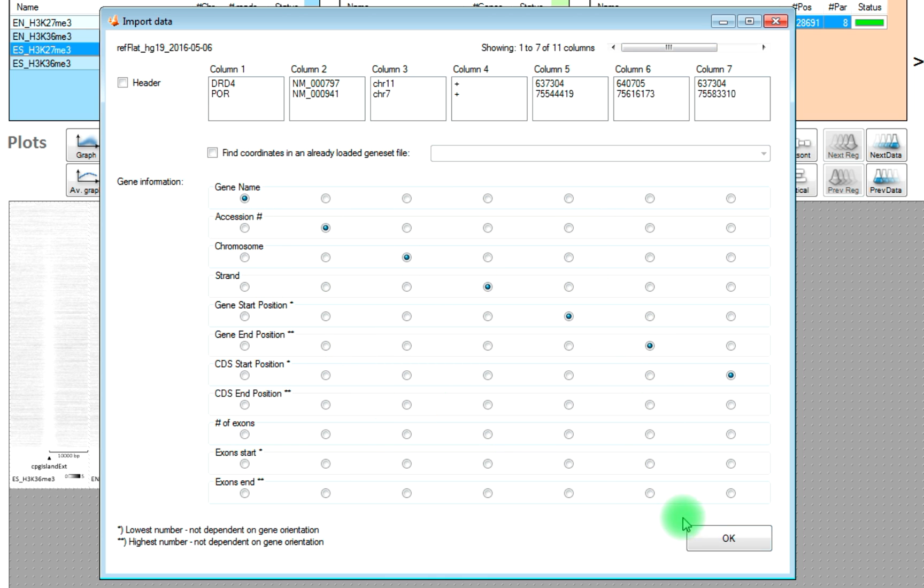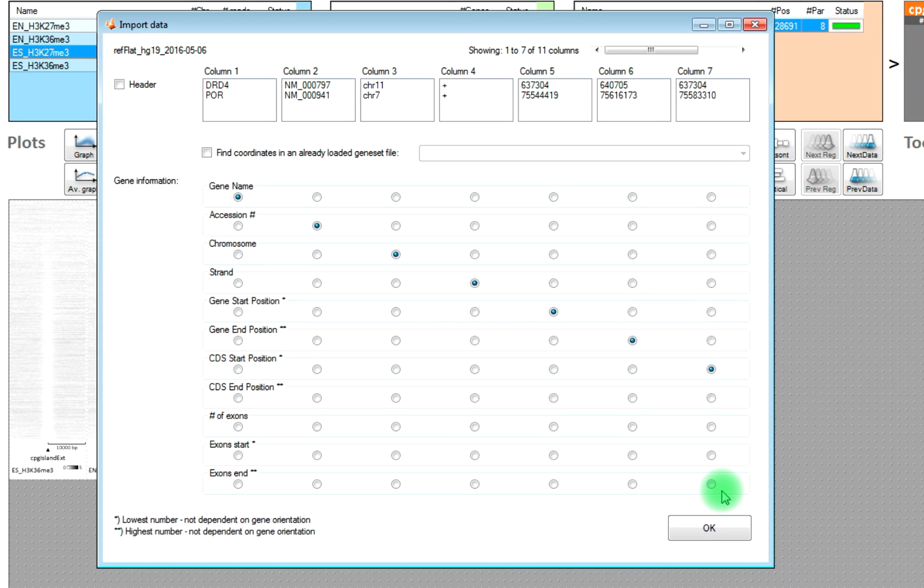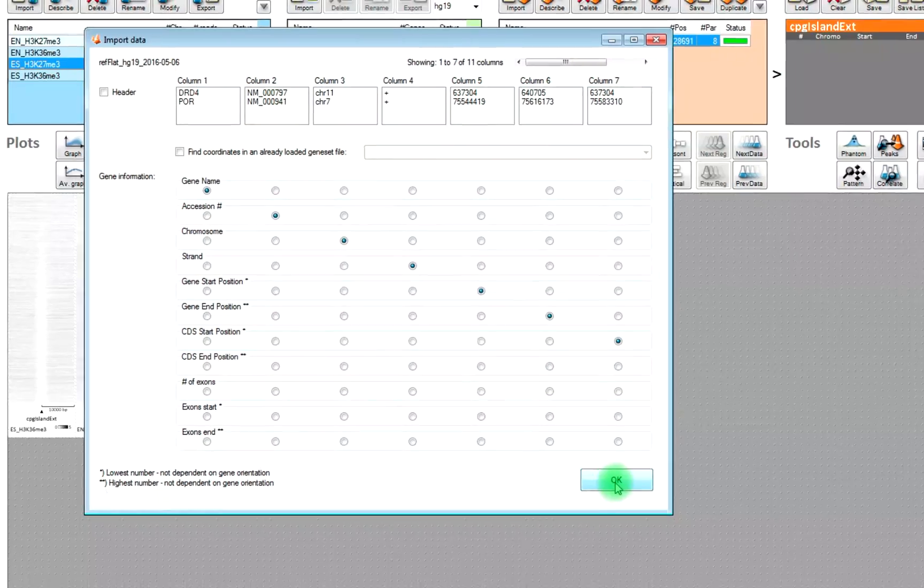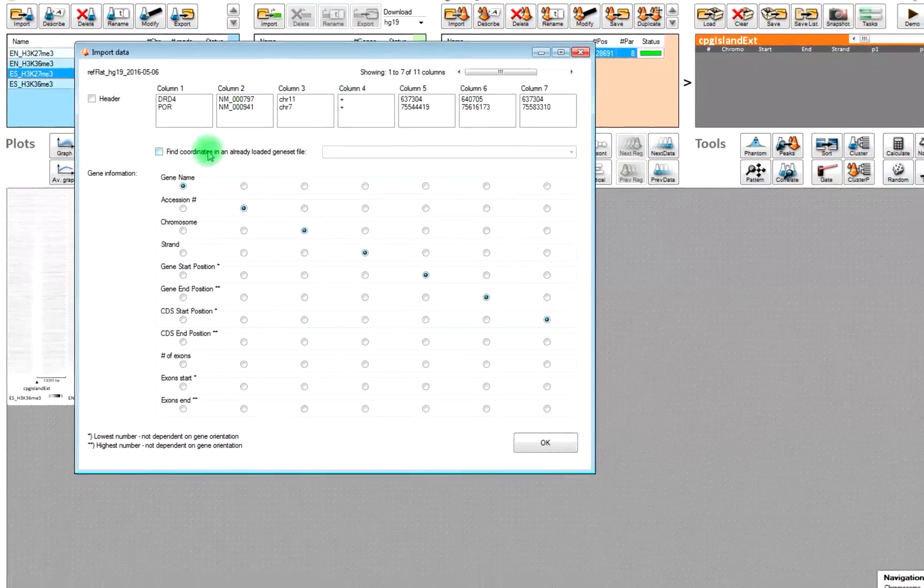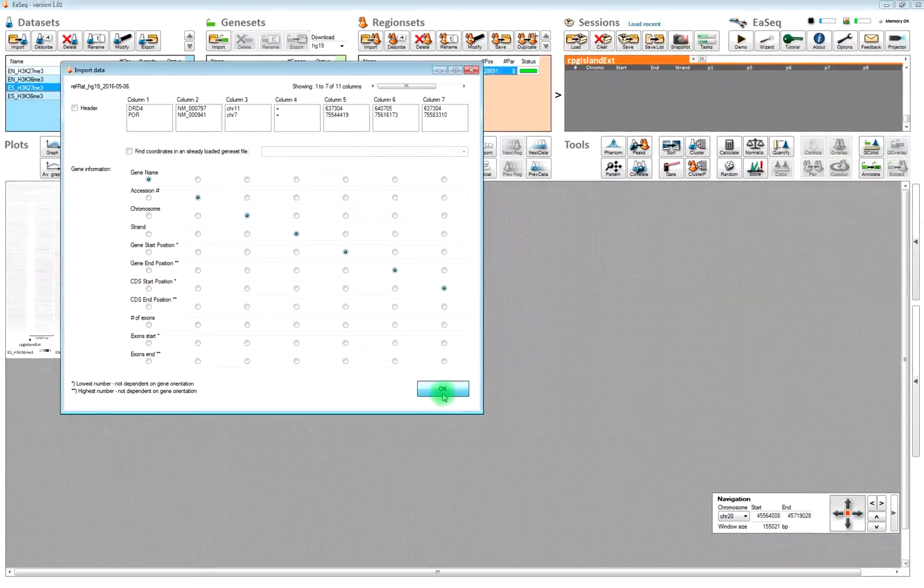But if you have your own format, then you will need to instruct ESEC on where to find accession numbers, gene start positions, coding sequences and things like that. But right now we can just go with the default.